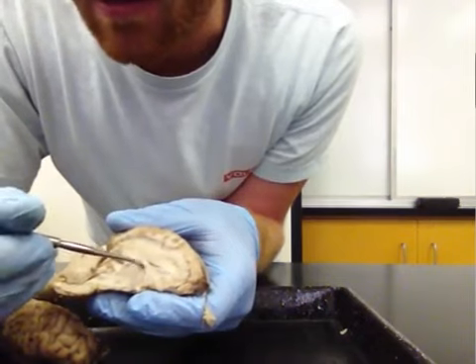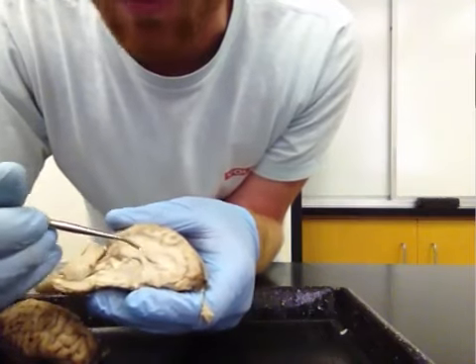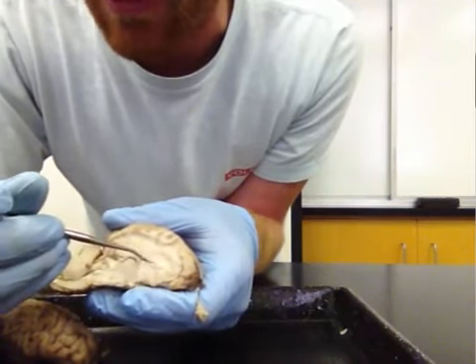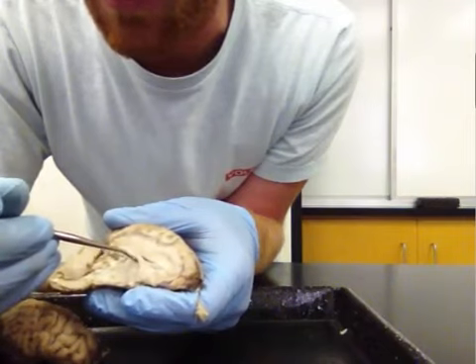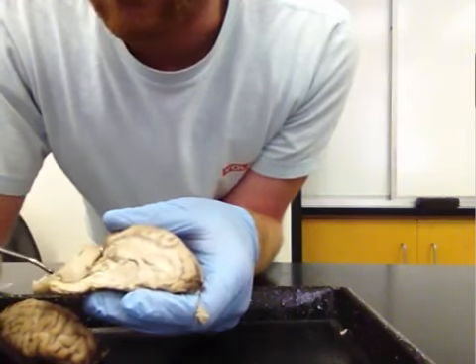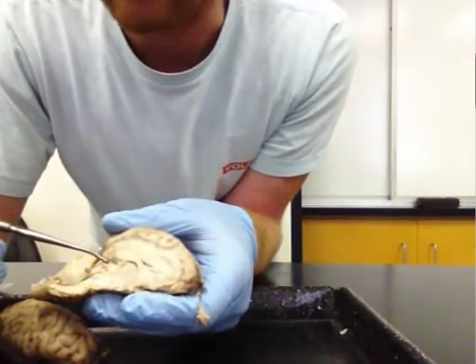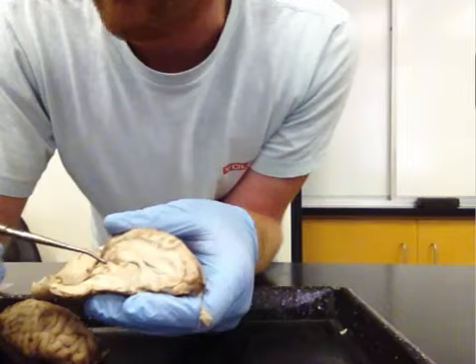There's a little bit of space right next to the corpus callosum, and these are the ventricles. Particularly here's the lateral ventricle. Then you have the third ventricle surrounding the thalamus. So these are some of the structures that we'll be able to see. In addition to those, there'll be some other ones that are outlined in your LabTube protocol.